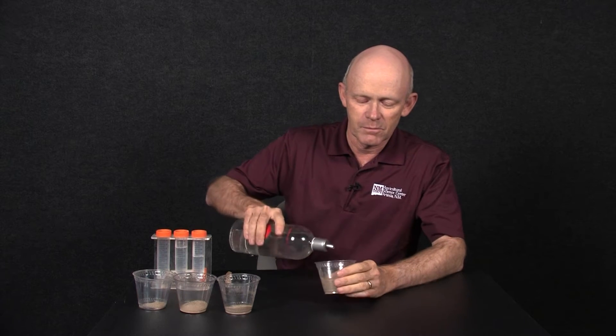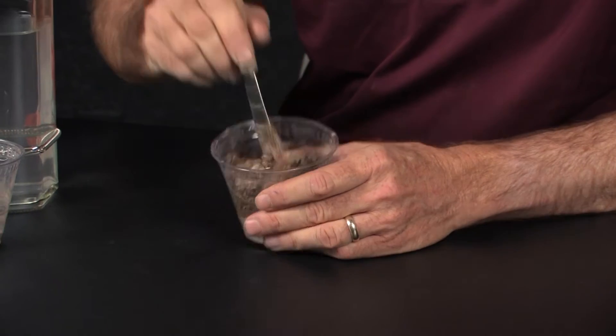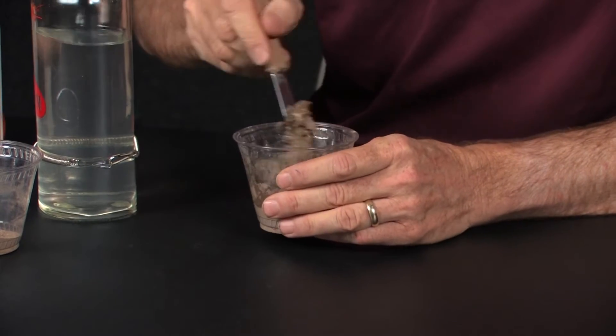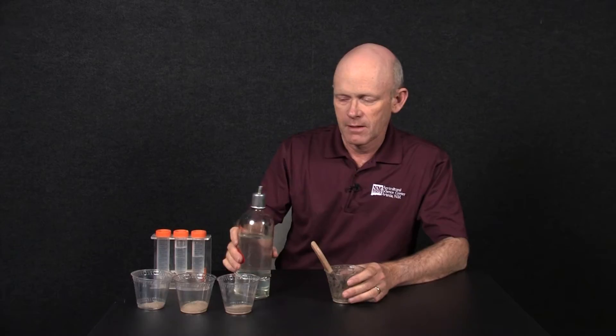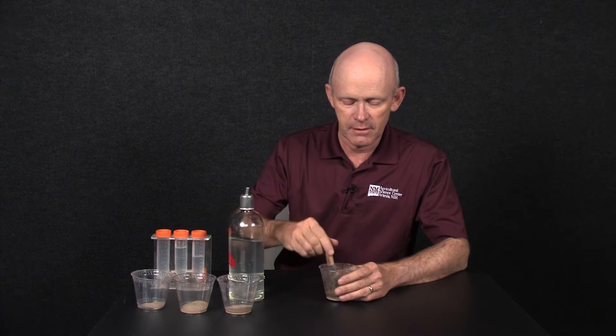It involves taking soil and water and then mixing it until it becomes saturated and has certain characteristics to it, which we'll describe. As I mix it, it's going to require more water. The nice thing about saturated paste is that once we get it to that saturation, it's the closest we can get to what a plant root would actually experience in the soil.